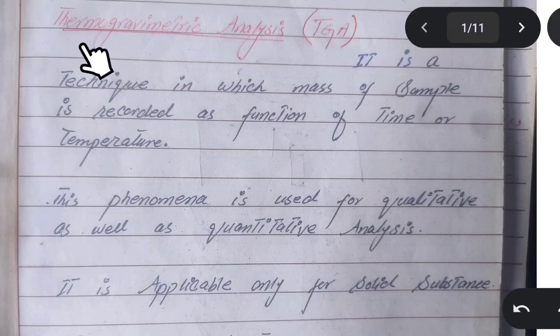Thermo is derived from a word meaning heat. Gravi is derived from gravity, meaning related to mass change, and metry means measurement. So thermogravimetry is a technique in which we measure the change in mass as the temperature is changed, or as a function of temperature. It is represented as TGA.